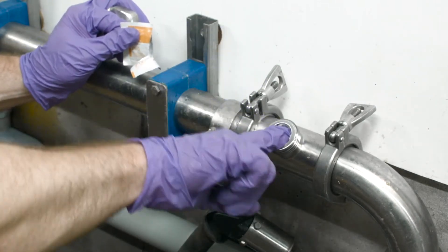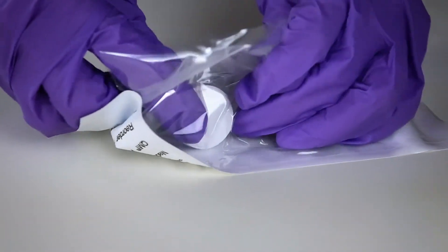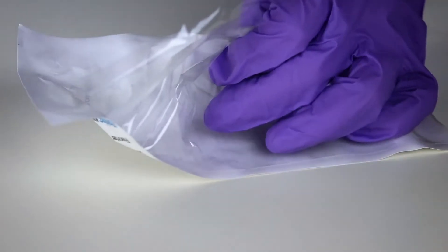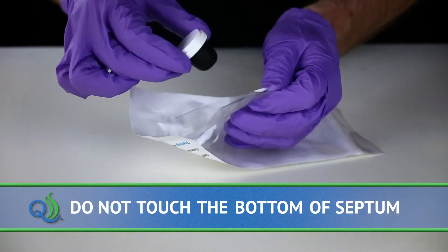Next, remove the appropriate QualiTrue sterile septum from the package by peeling the clear cover away from the white backing or by cutting the plastic package. Be sure not to touch the bottom portion of the septum.